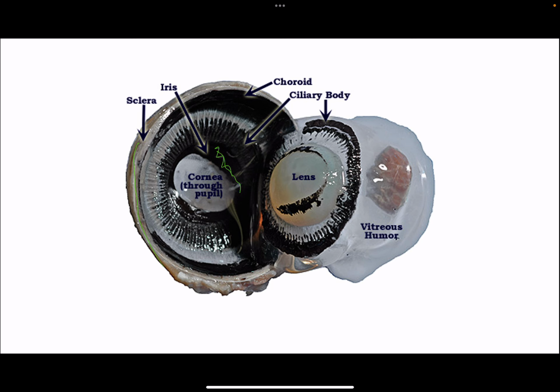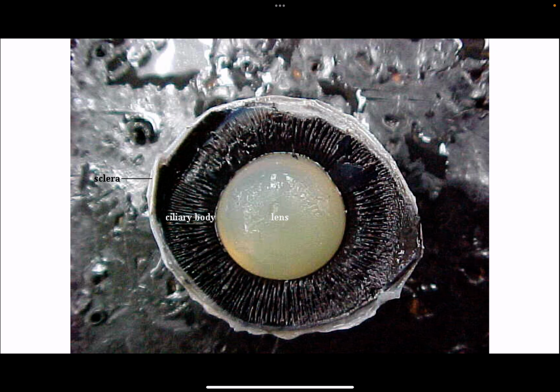This is all ciliary body with the ciliary muscle. So the lens is taken out like this. This is a marking, this is colored from here. Vitreous humor: you can see that jello-like structure. It's not loose like water, like aqueous humor, but it's a jello-like structure.